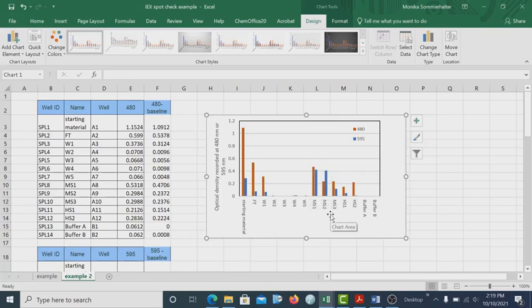Most of the PPO activity in this example was present in MS1, but it was also a good idea to collect MS2, MS3, HS1, and for this particular example, even HS2, the more high salt fraction still had PPO activity.